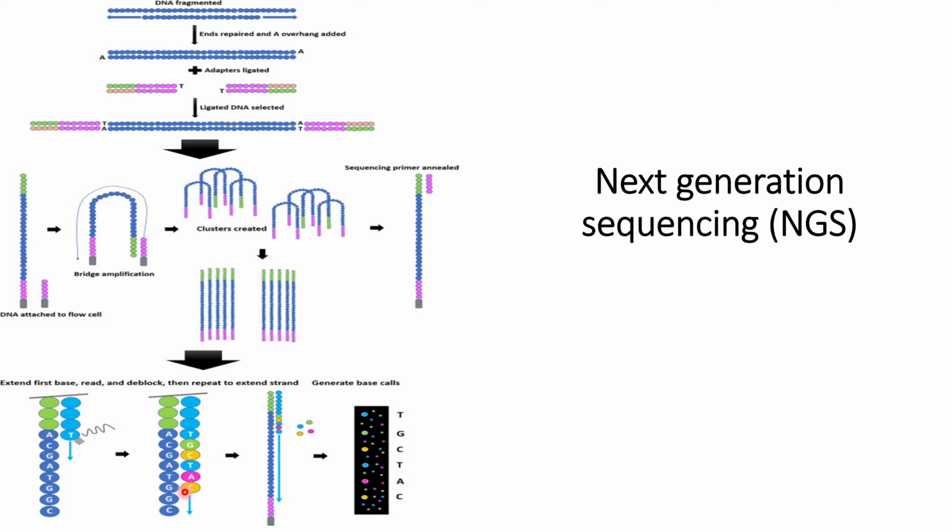The further extension of the sequencing takes place, and simultaneously the signals are getting recorded, as one example is shown here.